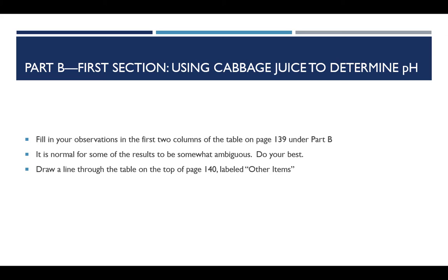We are not going to do any additional items beyond the ones specifically listed on page 139 to test for pH, so you may draw a line through the table on the very top of page 140, which is labeled Other Items.